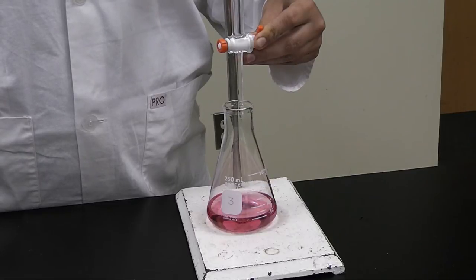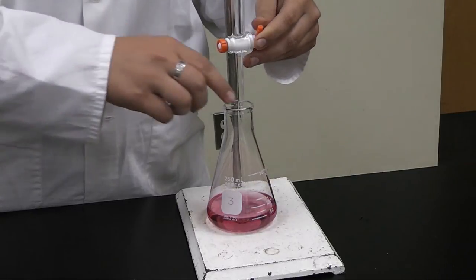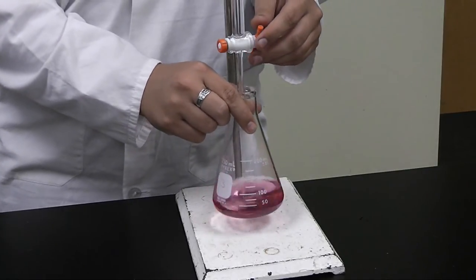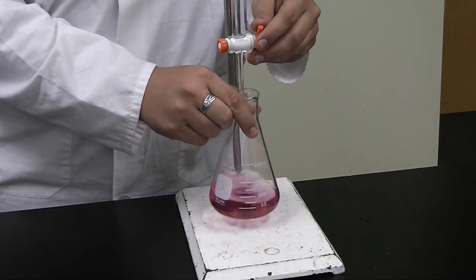Slowly turn the stopcock until your solution begins dripping out of the burette. With one hand on the Erlenmeyer flask and the other on the stopcock, gently swirl the solution.